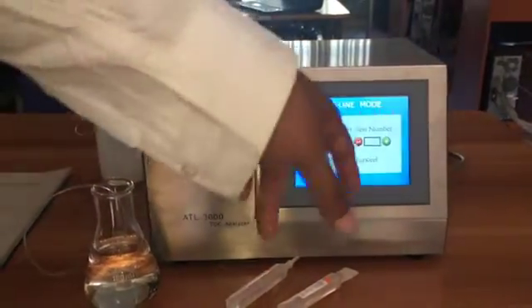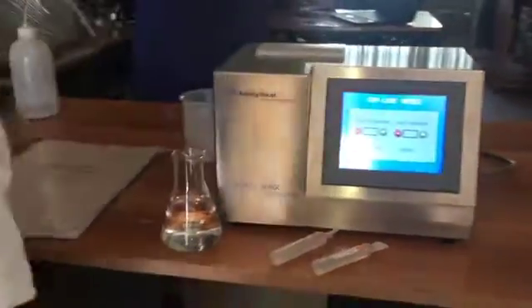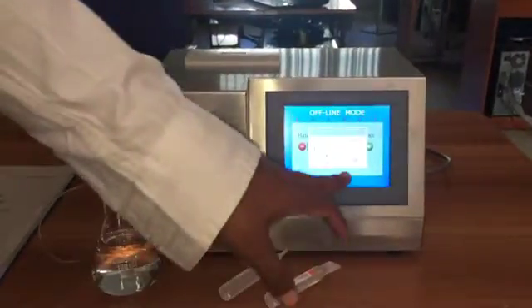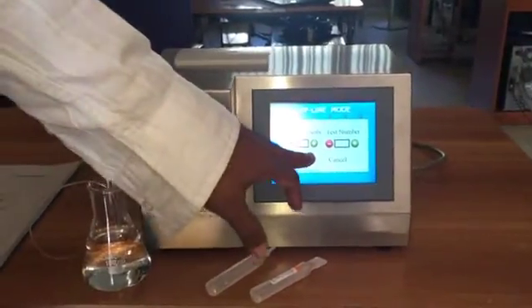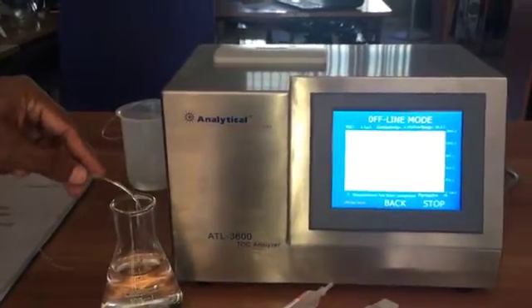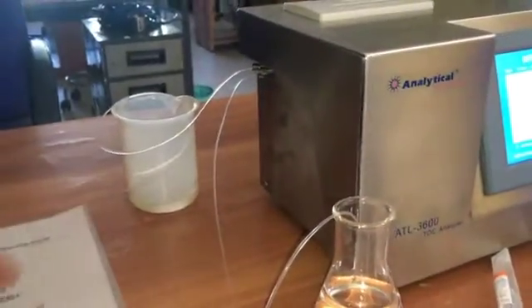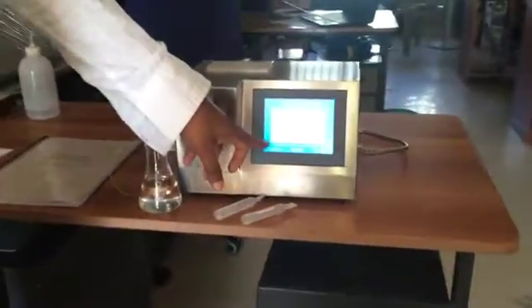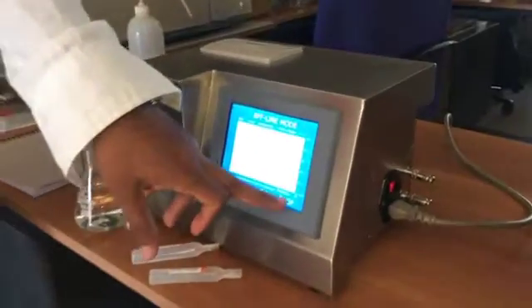You can choose the batch and how many number of tests you want to do with the same batch. For example, now I am taking it two times. Then pressing ENTER — now you can hear the sound: the peristaltic pump has started. The sample is being sucked from here and going through this tube, with the output going to waste.